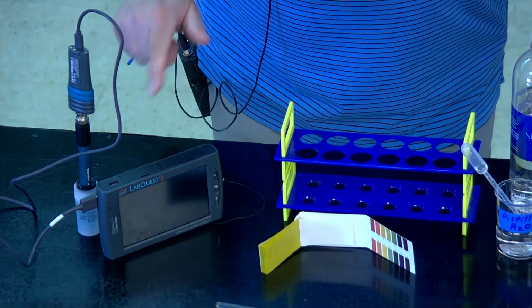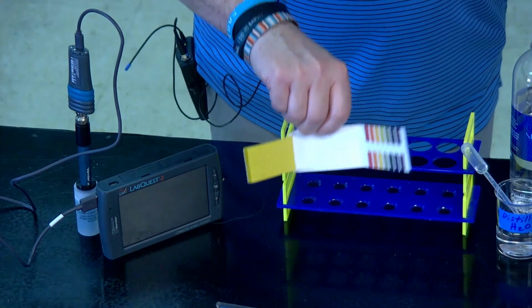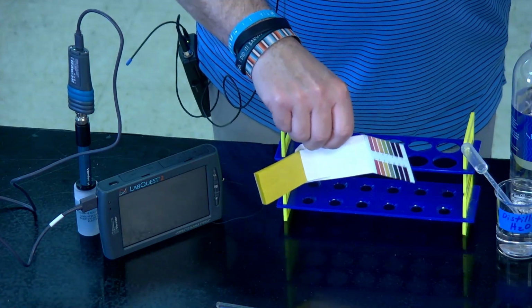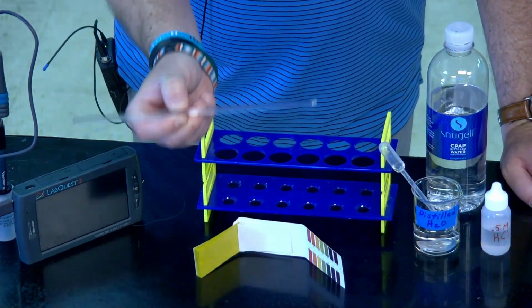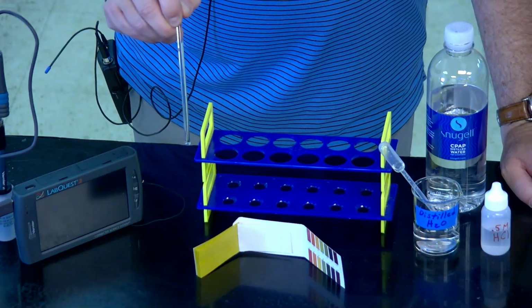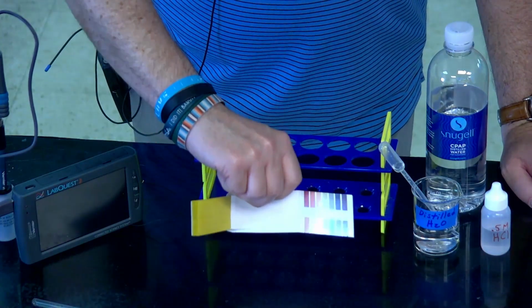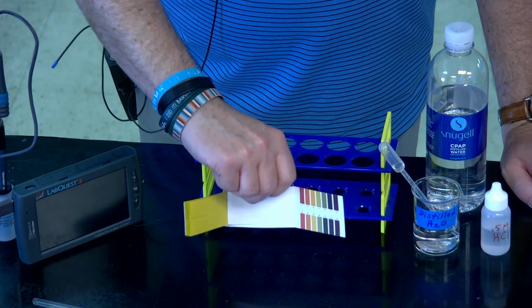If you do not have a digital pH meter, very commonly used to measure pH is just your general pH paper. And it comes with a color range. So what you typically do is you take some type of stirring rod, dip it into the large test tube, and then touch it to the pH paper, and give it about 10 or 20 seconds and see which color it matches so that you can go ahead and record the correct pH for that particular test tube.